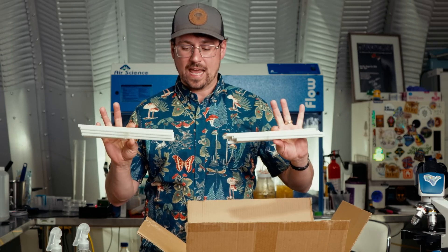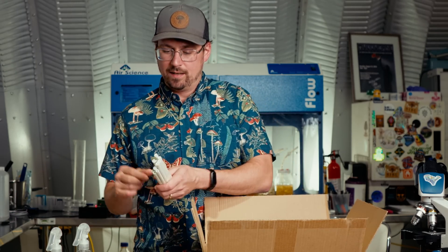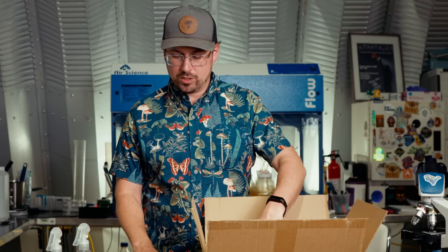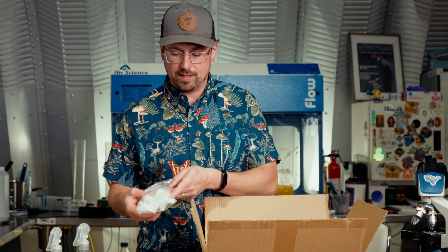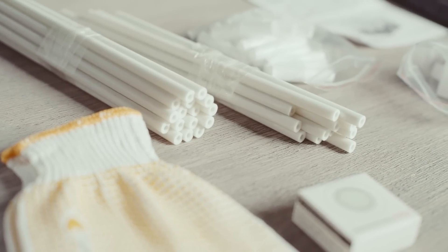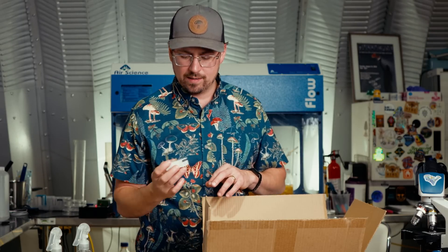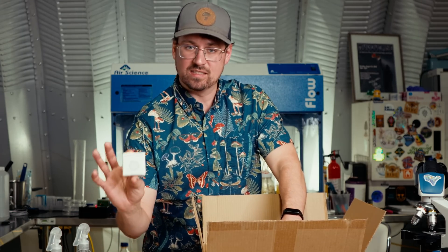These look to be the scaffolding that's going to create the body of our still air box. I noticed they're a nice firm plastic, which is good because that means they're going to be easy to sterilize — good job on them for choosing this plastic. These look like the scaffolding pieces you'll be able to build your structure with, and then there are some middle connectors. Lastly, we have a digital thermometer, which is useful to monitor the temperature of your environment wherever you plan to have the still air box. It's not super important when doing your processing, but it might give you a good idea of the room conditions for growing your mushrooms. Not necessary for the still air box, but still a cool add-on.